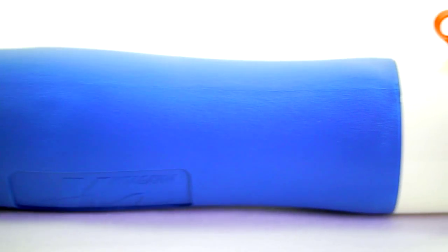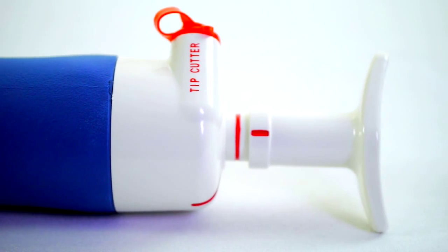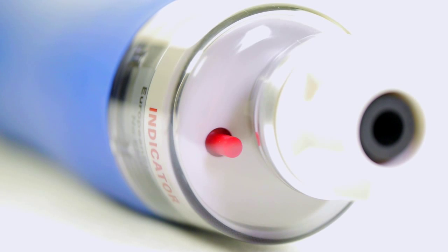I'm here to talk about the Kitagawa gas detection tube system. It's a very simple system for detecting gases, it's been around for over 50 years now and it's a quick and easy way to detect over 300 gases.